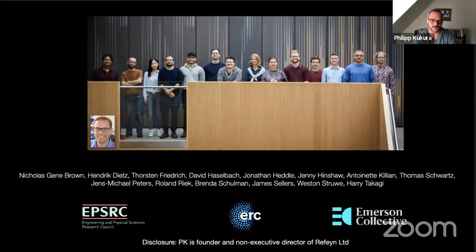Everything has a certain concentration range. Everything has a certain environment. All of this stuff happens in an environment that is definitely not physiologically relevant. But in my mind, there's no requirement for every individual experiment to be physiologically relevant. What you do is you obtain information on a particular system, and you take that information in the context of everything else there is, and see whether you can make sense of what's going on.